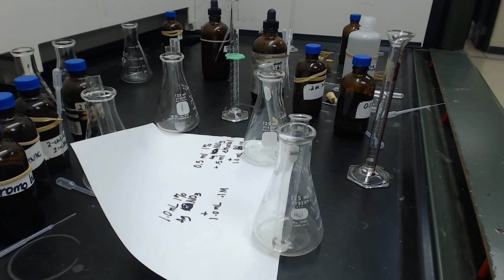All right, so finally, the last piece of the data is that now we're going to test the concentration. In that last one, we were testing the concentration of the substrate, the 2-bromo-2-methylpropane. We saw that when the concentration of the 2-bromo-2-methylpropane was doubled, the rate pretty much doubled. But now we're going to see how the change in the silver nitrate will change it.